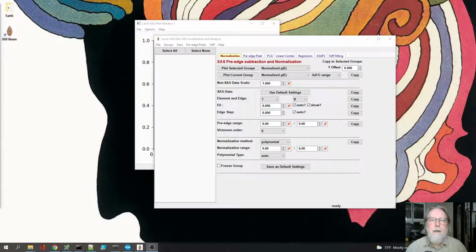In an earlier video, we analyzed arsenic sulfide extended XAFS data using a Feff calculation for one scattering path. That single shell fit introduced many of the concepts for doing extended XAFS analysis with Feff calculations. In this video, we'll analyze a spectrum with two paths, expanding our repertoire of extended XAFS analysis.